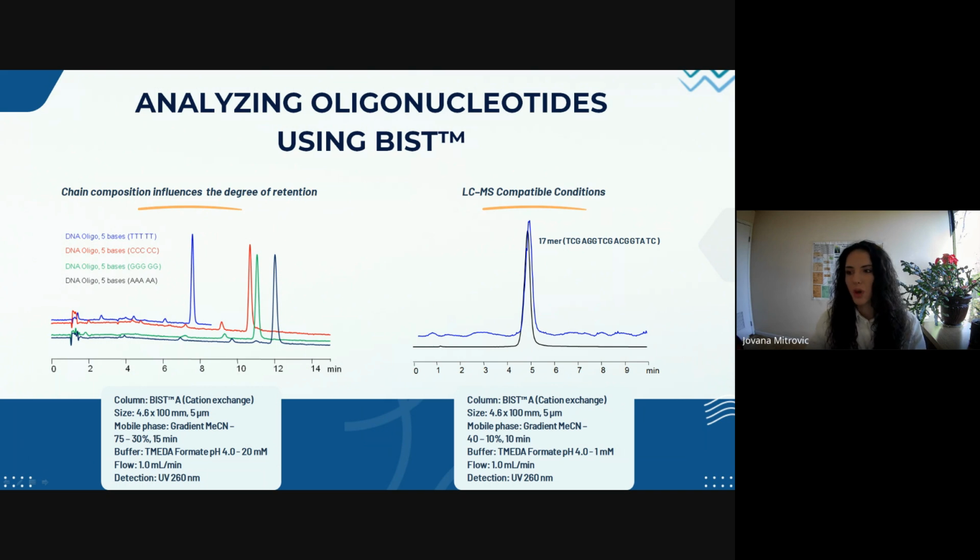They mediate and modulate the electrostatic environment and accessibility of those inherent negative charges, impacting the oligo's overall charge distribution, stability, and behavior.